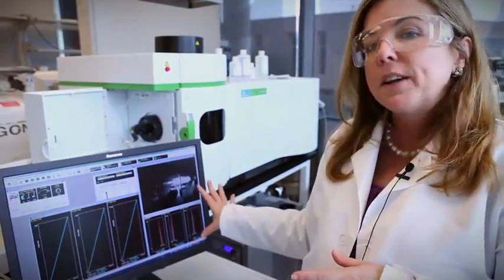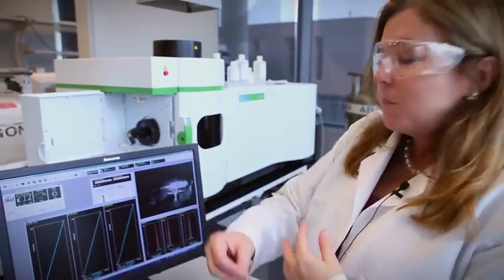So the OES spectrometer is a real go-to system. You use it for a lot of samples. You can't use it for solids, of course. They have to be in a liquid phase. They have to be able to be sucked up through that straw. But pretty much almost anything you can imagine that's liquid, that has a metal in it, you can analyze using this machine. Typical detection limits are going to be on the order of maybe a hundred parts per billion, possibly a little bit better depending on the configuration of the system.